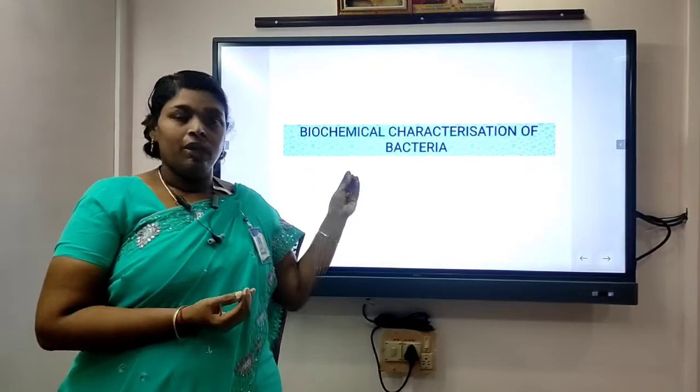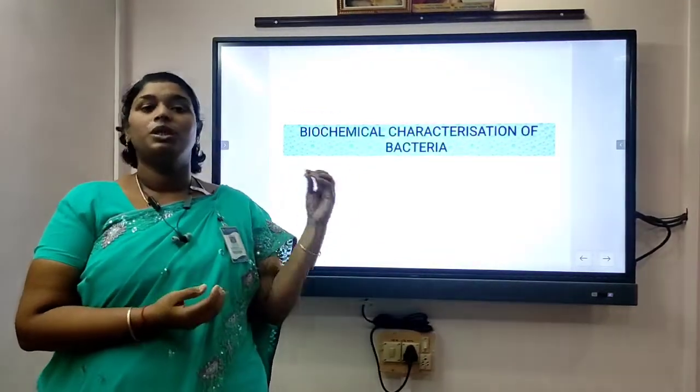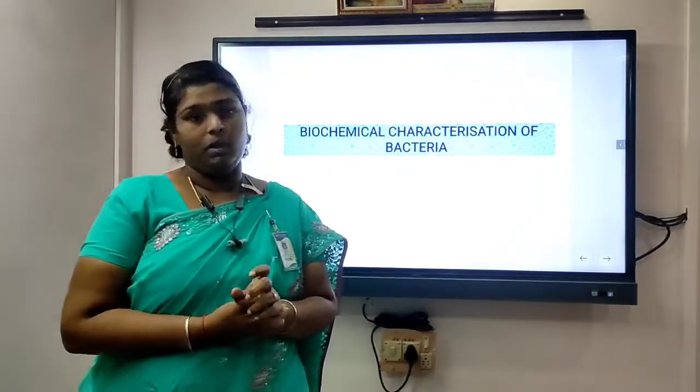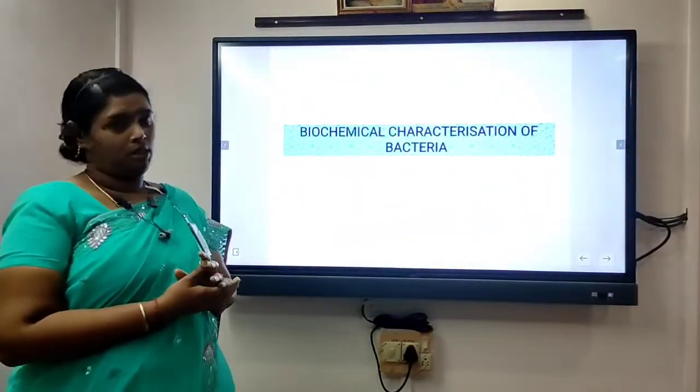Today we are going to see how we can characterize an organism using their biochemical properties. So the common biochemical characterization tests we are going to see today.